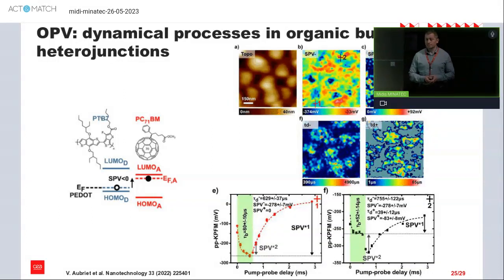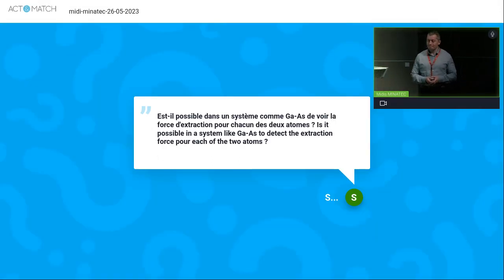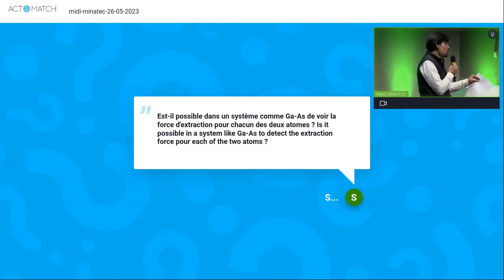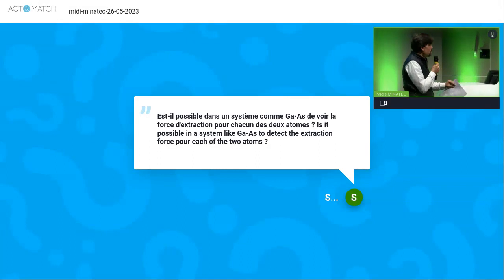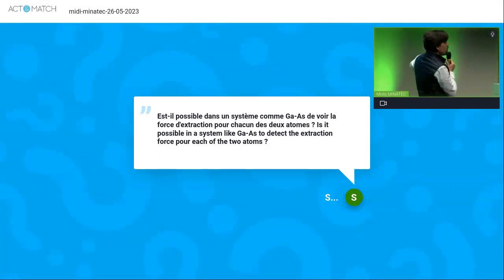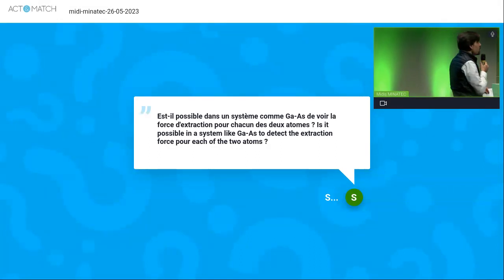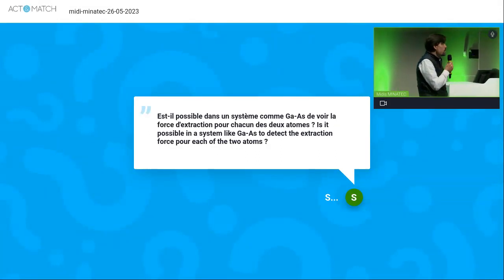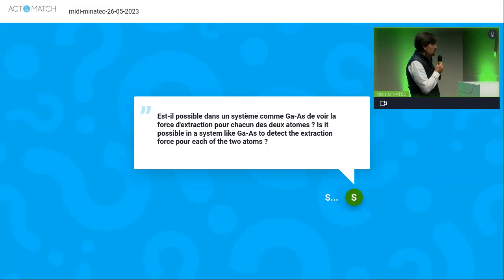In relation with that, we have other questions. When you do contact mode measurements, how can you estimate the contact resistance between the tip and your sample? In the example that you put, where you would measure the resistance of your layer by doing a two-point measurement, how do you estimate the contact resistance?